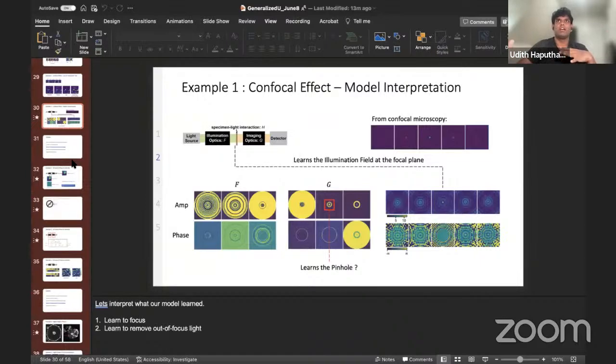What I noted is that L1 or SSIM measurements we cannot use, mainly because the ranges and scales are far different. So I want to find the best pinhole that generally gives a better looking image.